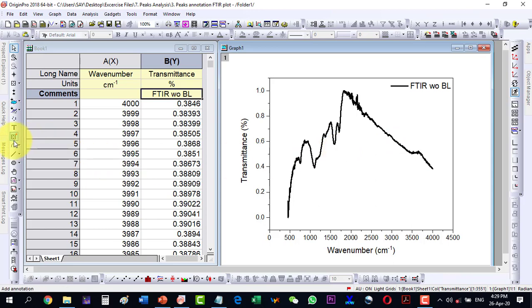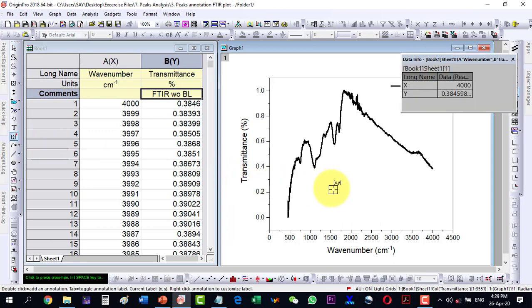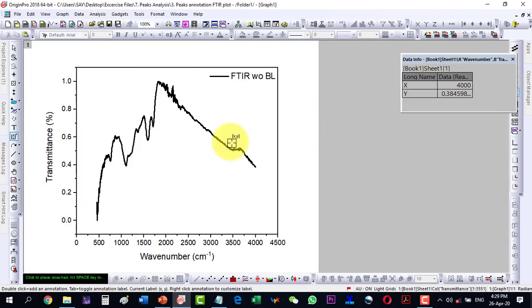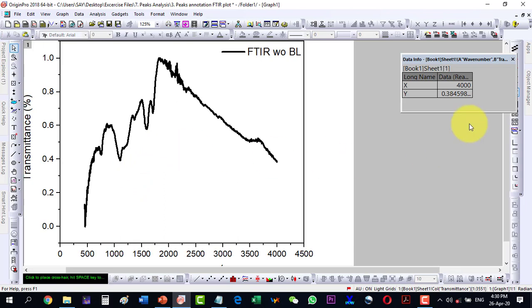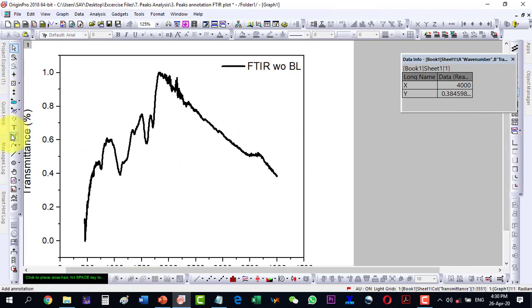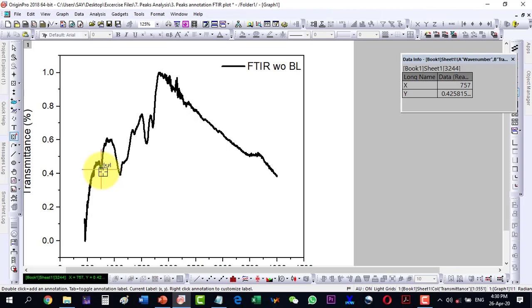To do such kind of labeling it is very easy to use the annotation tool. Click on the annotation tool and zoom the figure a bit more. If for example I am interested in a specific peak and want to know its location, I click once on it.